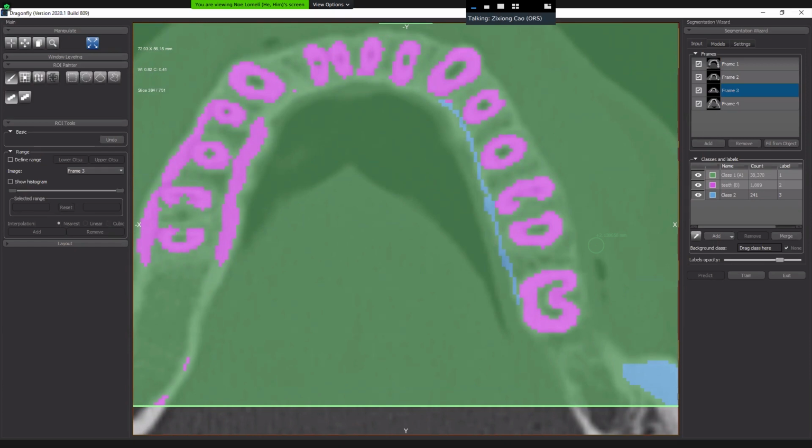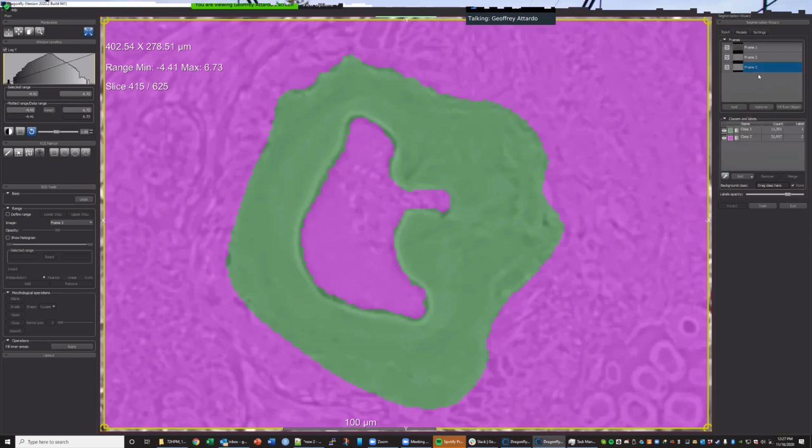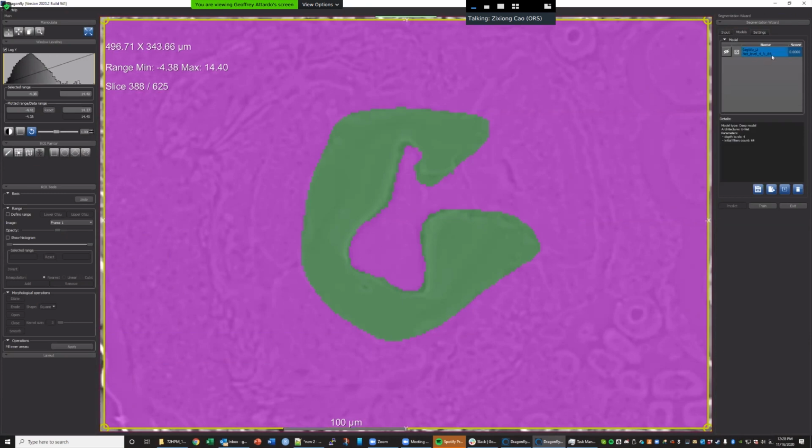Okay, that's good. So we can switch back to you. Stop sharing. So now you have 1 frame. Let's control again. And you created 1 frame and you filled the frame. Oh, you created 3 frames. Good. Let me check the 3 frames. Okay, I think they are very good. Then we can create this. This is the same model we did before. Oh, you created this model, right? Yeah, I just created it. Okay, perfect.